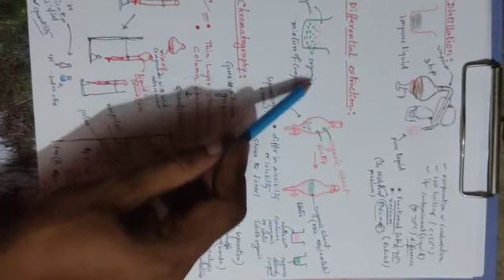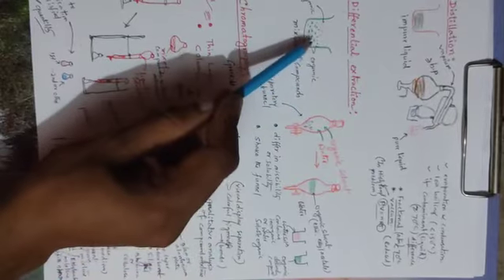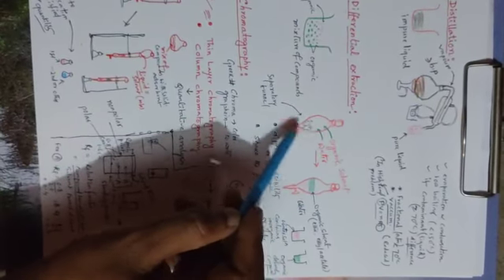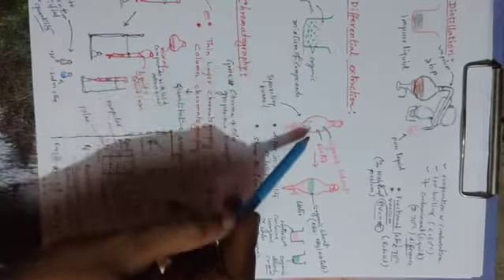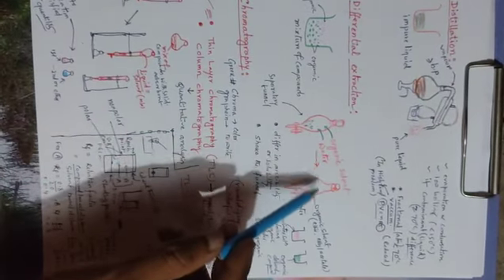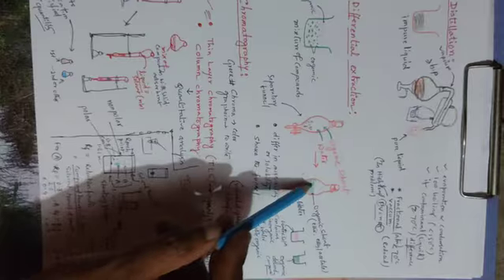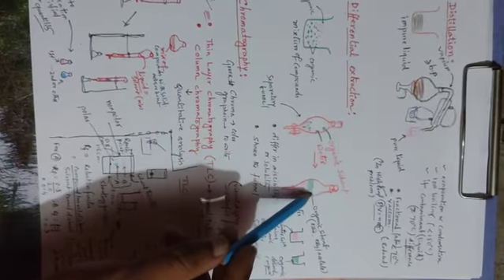If our organic compound is miscible in the organic solvent, and the inorganic metals or other contaminants mix with the water, then basically the partition coefficient works here. After putting in the solvent and this raw mixture of compounds, we shake the separatory funnel, and after that we keep it standing for a few minutes, and then we will see two different layers.